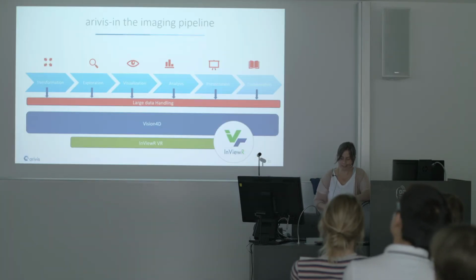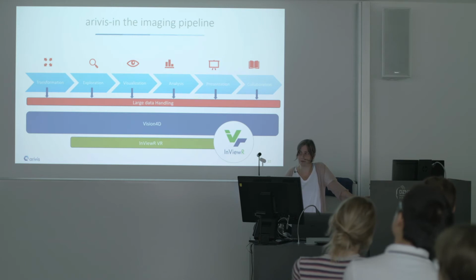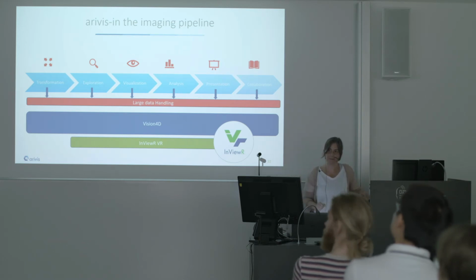Basically this leads already to, or if there are questions about Vision 4D, I'm happy to answer. Otherwise, I will continue. Yeah?